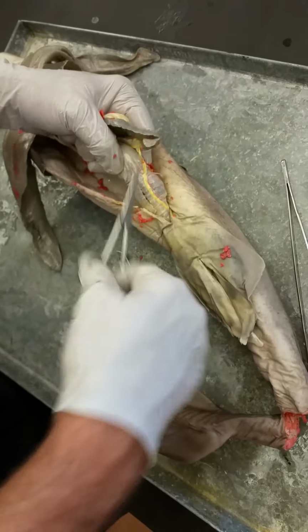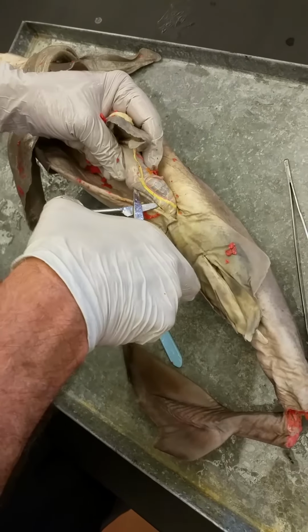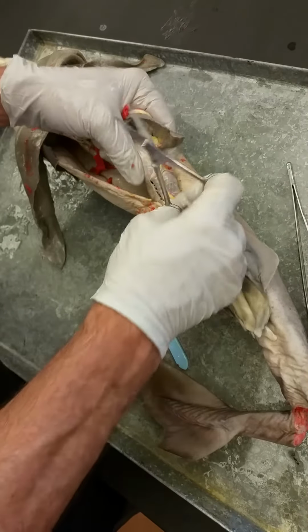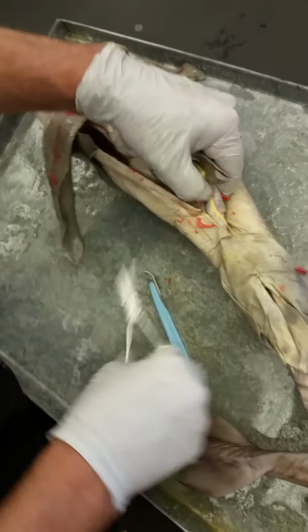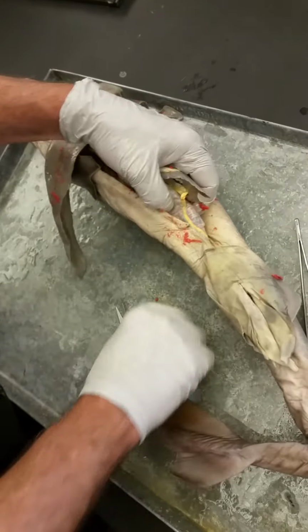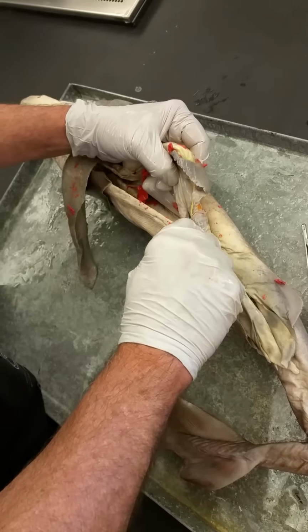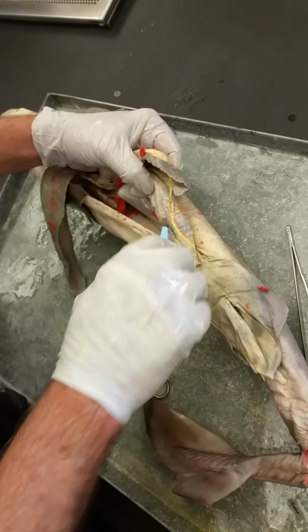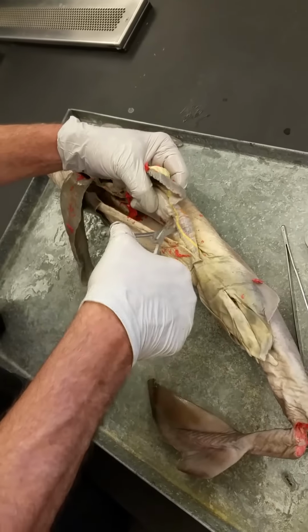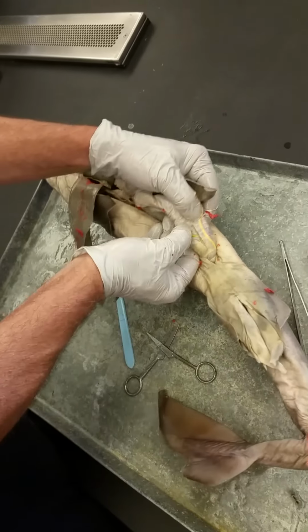So again, when you're not cutting through skin, the best way to use your scissors is to stick the point in and spread, as opposed to trying to cut with it. That way things tend to tear more along natural lines. And then you need to extend that a little longer, so you can see the inside.